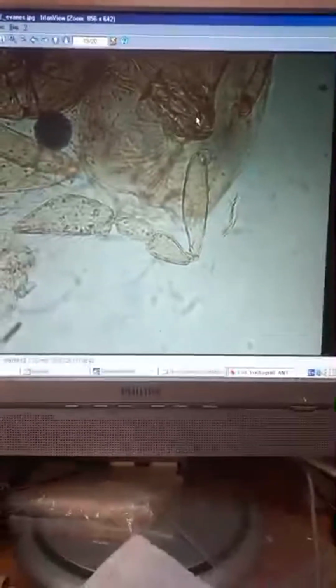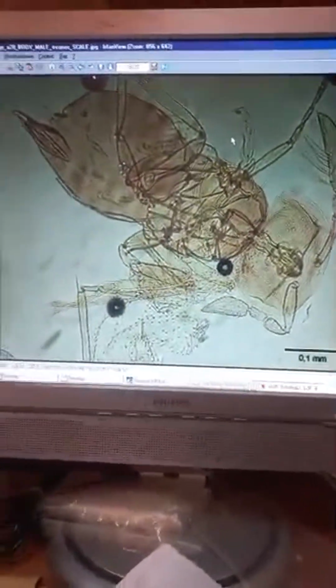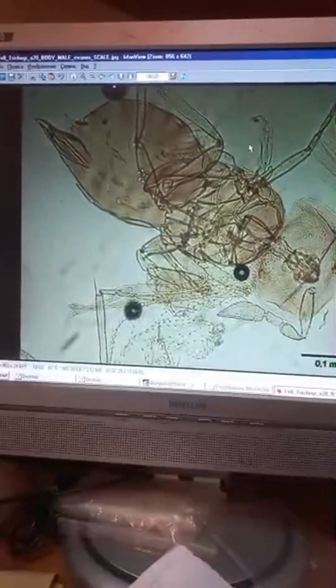So if you understood, sometimes in a large culture you can receive some kind of hermaphrodites, individuals with different features. Thank you for being with us. I hope it was funny, interesting and entertaining for you. Today I showed you some photographs of two species of Trichogramma, Trichogramma achaeae and Trichogramma evanescens, which are bred at biological laboratories for the application in biological control of corn moths in Ukraine. So some laboratory can keep one species, Trichogramma evanescens. Other laboratory may have two different species, Trichogramma achaeae and evanescens, but it needs to be very careful, don't mix them, because it's better to make application with correct species in agricultural conditions.